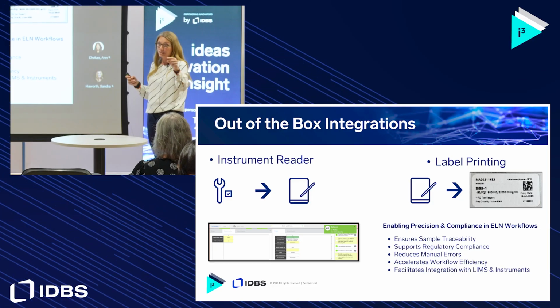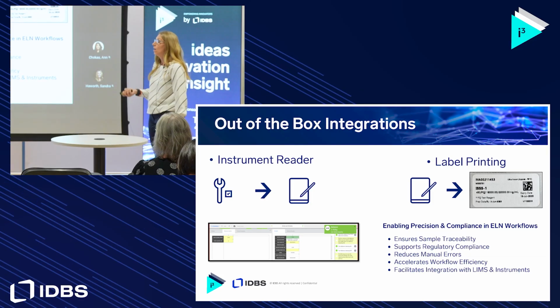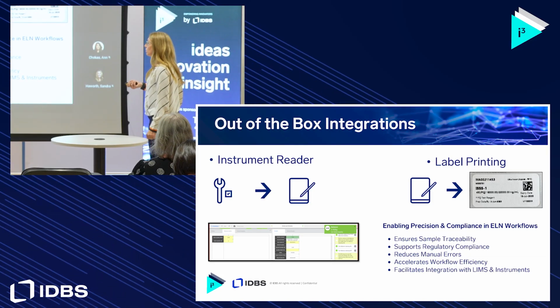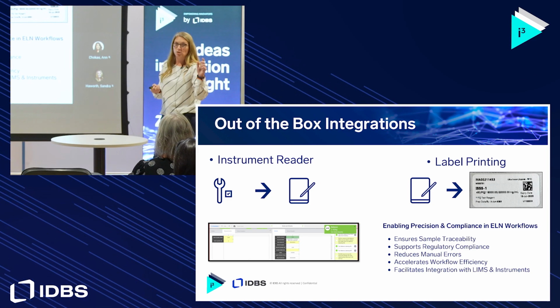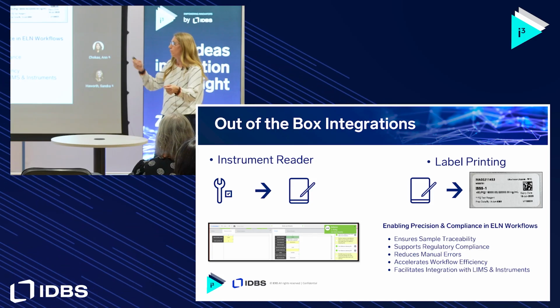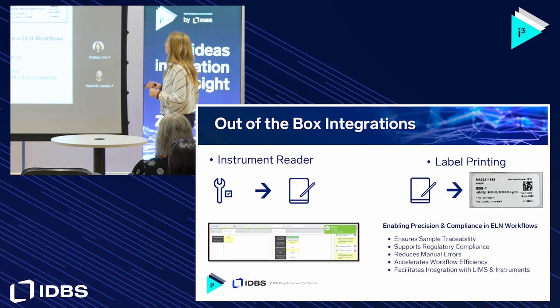It was received from this balance on this date and time, from this IP address and this port. So the audit trail around instrument reader is very good. And of course, you don't have to manually type in a number, which is also really nice. Our other labs that were on paper would have to print that weight out, tear it off, attach it to their ELN experiment before we implemented this. So it's been really great.